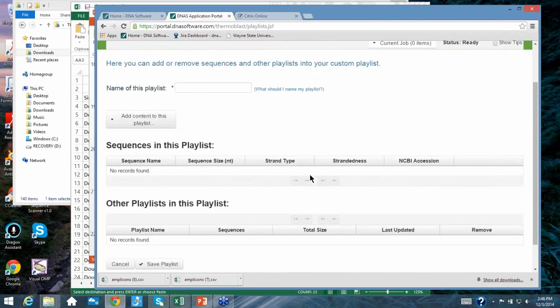But for the primers and probes, we support a variety of strand types. In fact, we have more than what's shown here. We're going to be updating the portal very soon to include morpholino, PNA, 2'-O-methyl, phosphorothioates, and a variety of modified nucleotides like LNA, and those things will be coming later on. So we do support a variety of those as well. But that's where you do it, right there. So enter in the strand type.